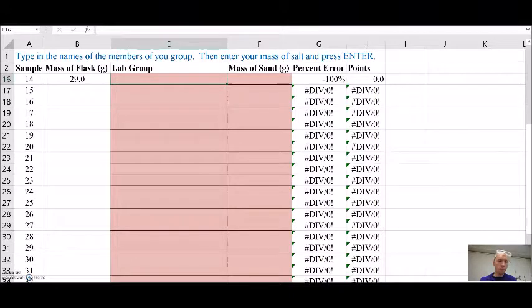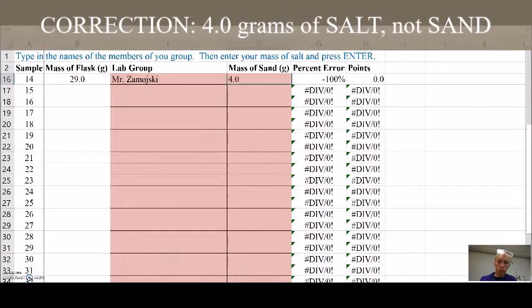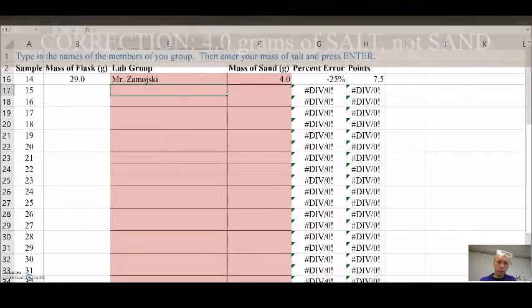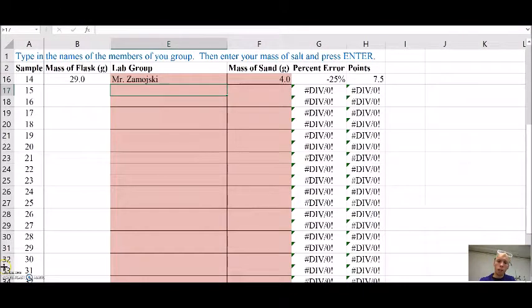All right, I've taken another attempt at this. So I have a different sample here. I'm going to put in my name again. And this time I got 4.0 grams of sand. So here we go. Big moment. All right, better. Not as terrible as before, but still needs some work. So I'm going to take a couple more tries at this and see how I do.